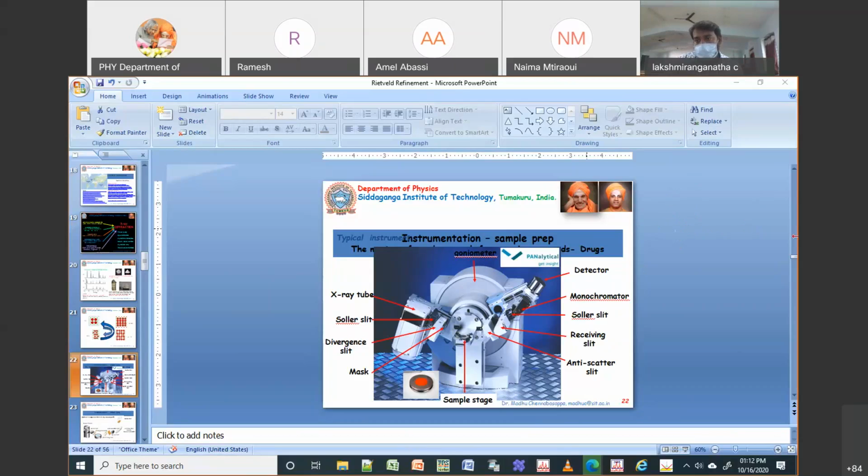Previously I used GSAS, but I need to decide which diffractometer type, and I am not sure about it. Does FullProf need such information as well? Could you please explain?